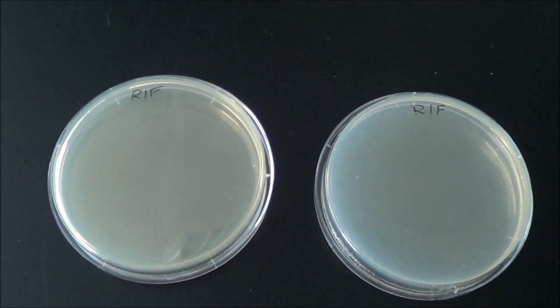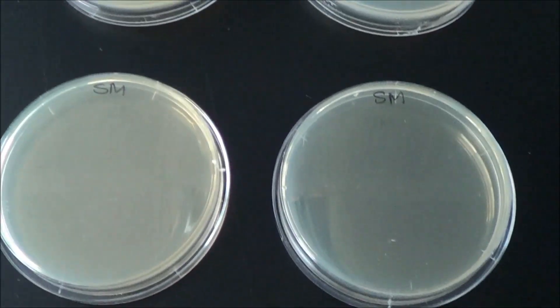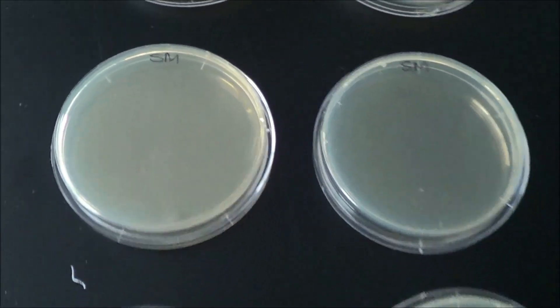Allow the plates to set at room temperature. The plates need to be dry for the next step.